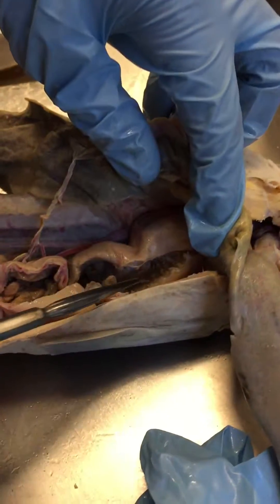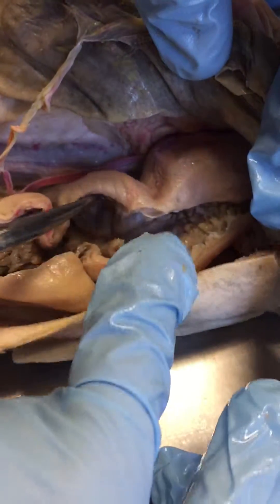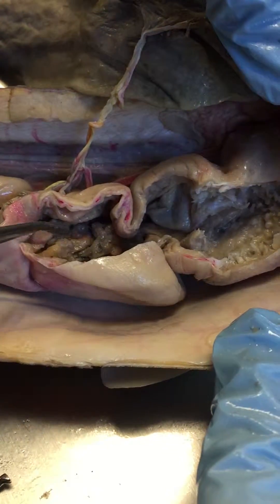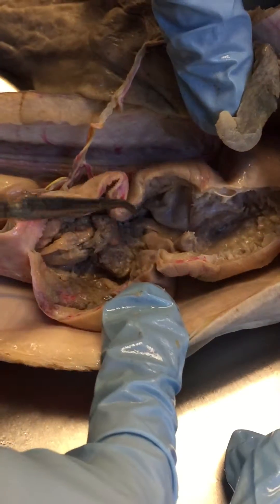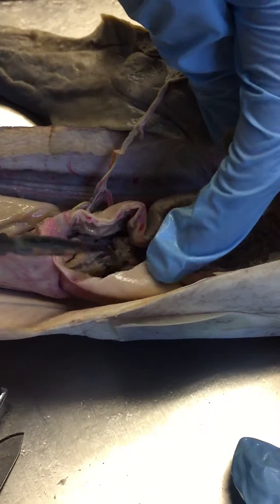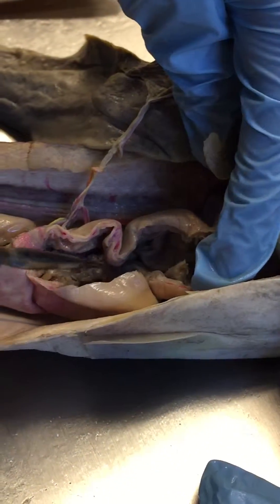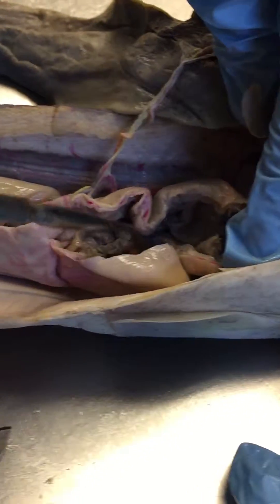We're going to continue with the digestive system of the shark, moving from the esophagus to the stomach. The esophageal-stomach junction is right here — you can tell the difference from the inner contents. The body of the stomach is just this region where she has her probe. The cardiac region is the top part, separating the esophagus from the actual stomach.